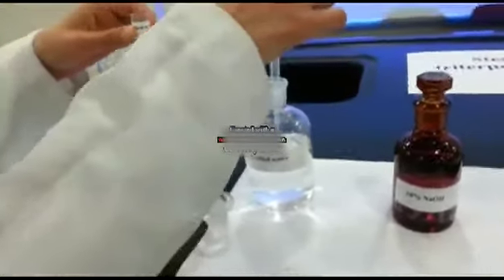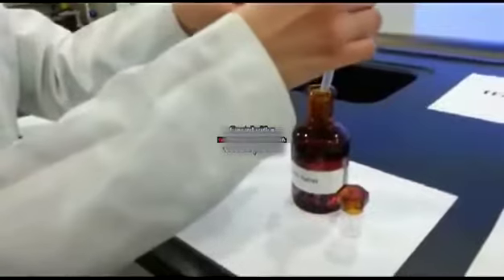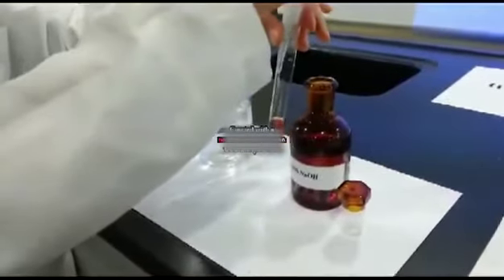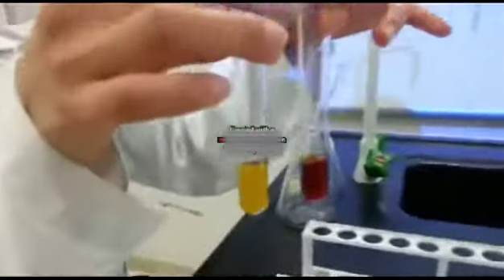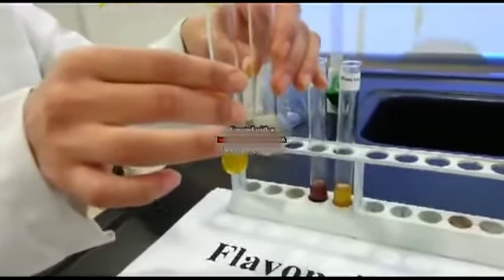To the second test tube, add 2 ml of NaOH. This is the NaOH. Now we will compare the color of both the test tubes. The darker yellow color shows a positive test for flavonoids.